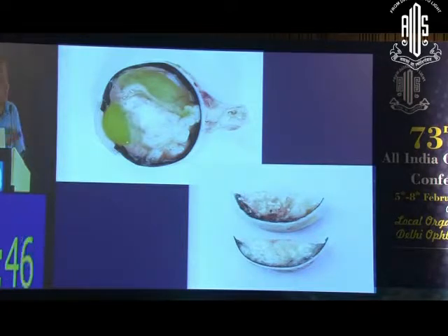Now, previously I mentioned that one should sample the central calotte as well as the peripheral calotte. How do we do it? This is the central calotte. You take a section from the pupil to the optic nerve, and that becomes the central calotte. The peripheral calottes are sampled like this.